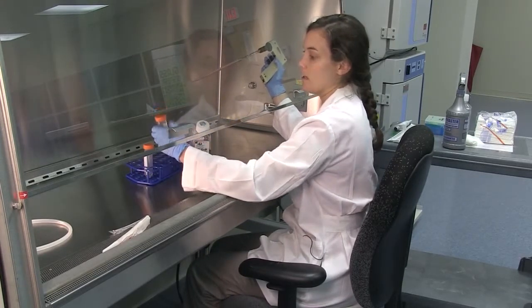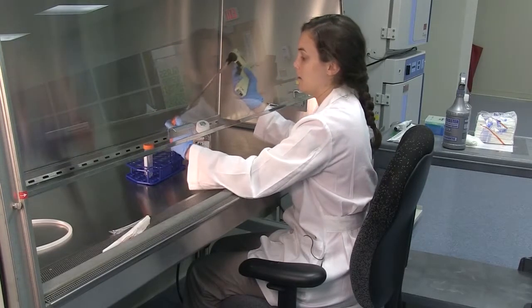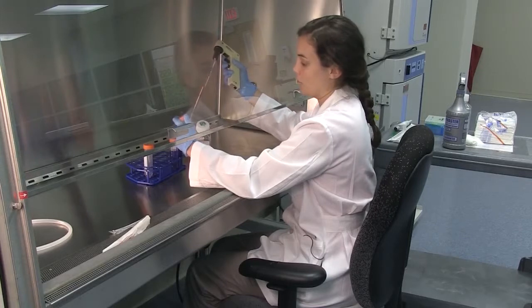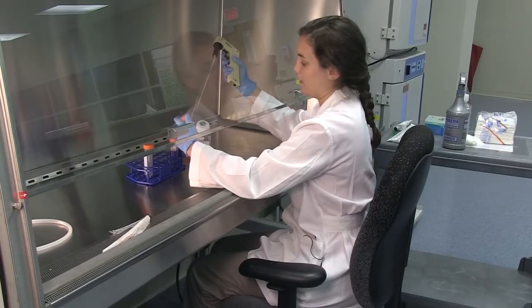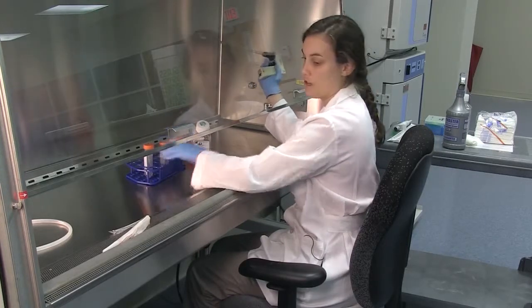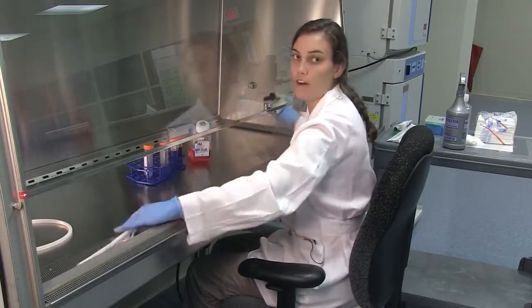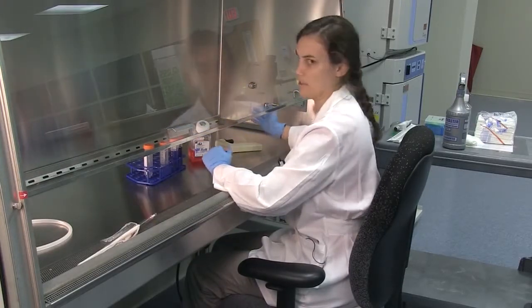With the other hand, take the cap off the receiving tube and transfer your media. When you're done, put the lid back on, and if you're finished with your pipette, discard it.